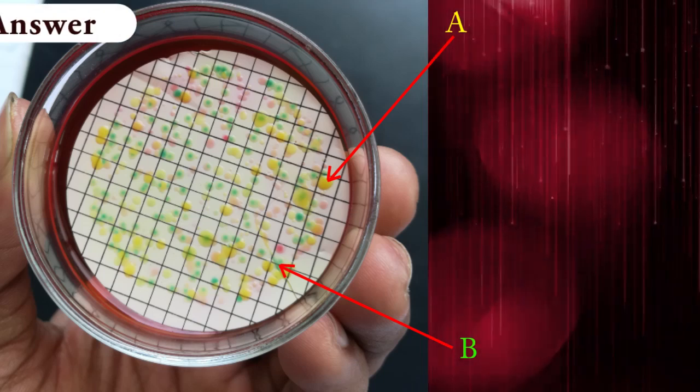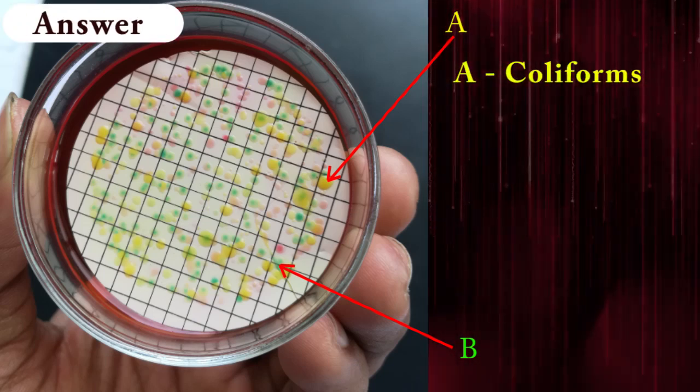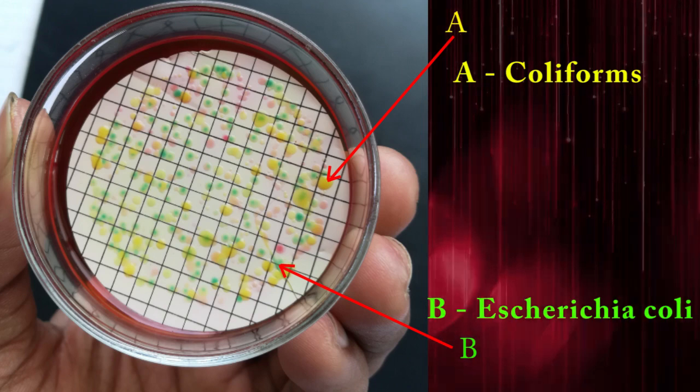The correct answer is: yellow color A colonies are coliforms, green color B colonies are Escherichia coli.